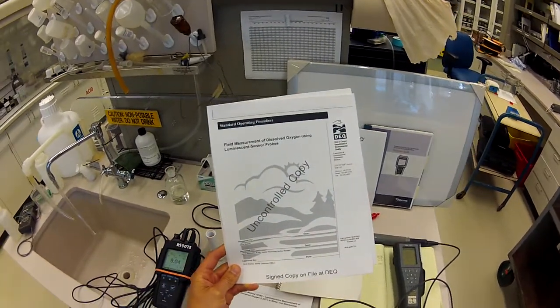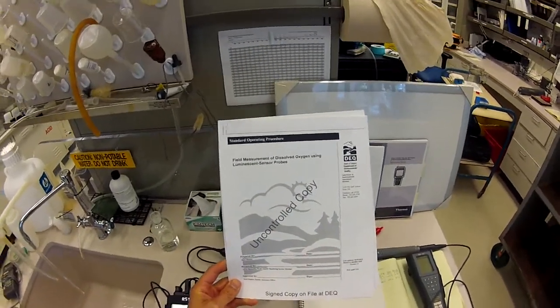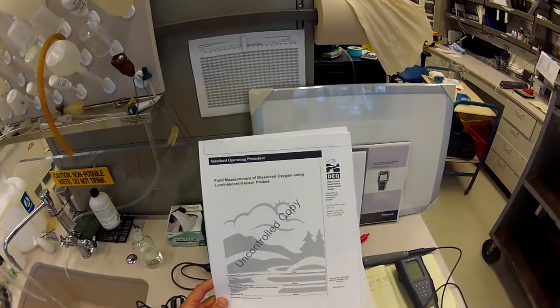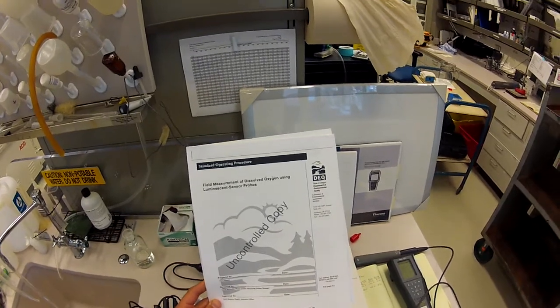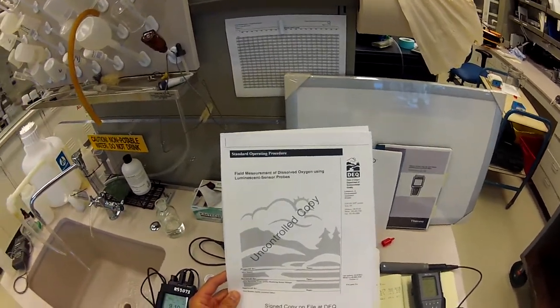Thanks for joining us. We're going to run through a calibration of luminescent sensor dissolved oxygen meters following the Oregon DEQ's laboratories water quality monitoring sections standard operating procedures.